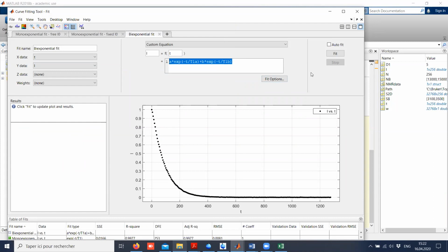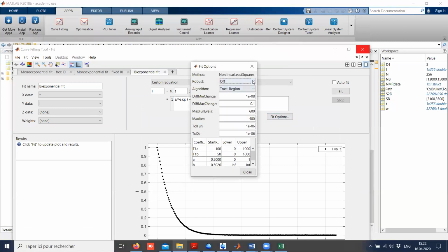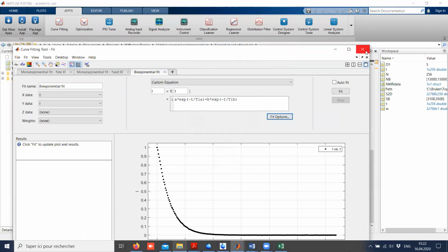Okay, interesting. I think it makes a big difference in the algorithms you can use to do your fit. That's why. Yeah. Just as an FYI, in Mathematica, it's possible to do such things. Yeah, but it really modifies the type of fit you can do. There are some algorithms that they use. Anyway, interesting question.